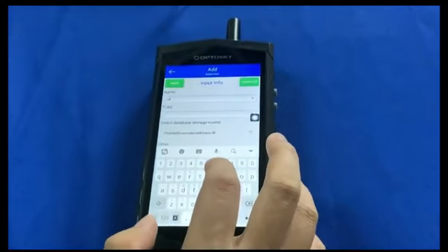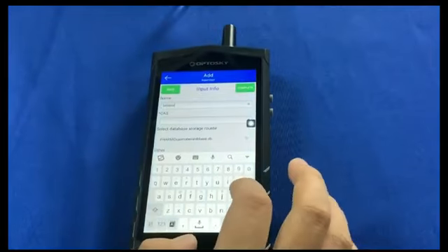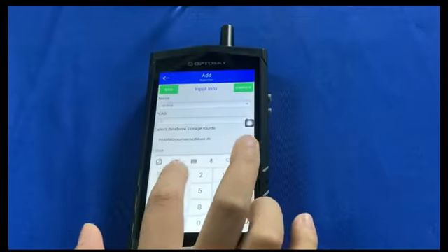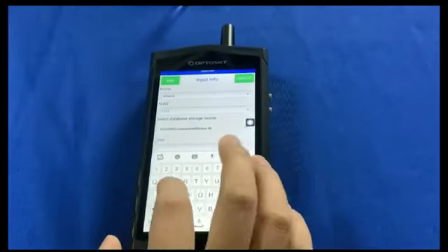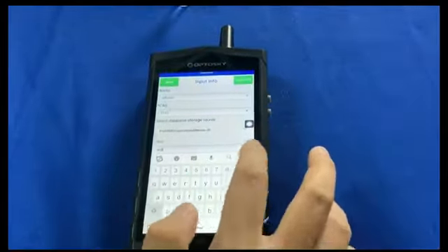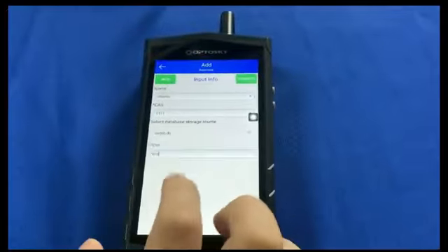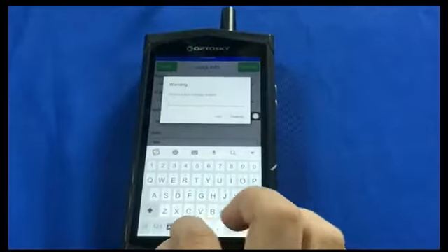Spectrum ethanol. You have created the ethanol and run the scan test. Use the ethanol in the vial. We use the scan test. Here our engineer didn't use the liquid sample cell. It's better to use the liquid sample cell.